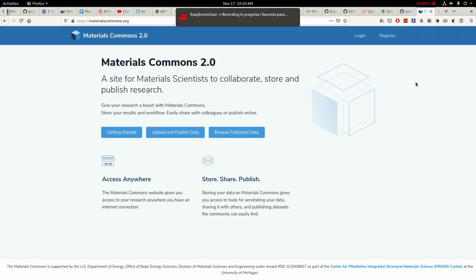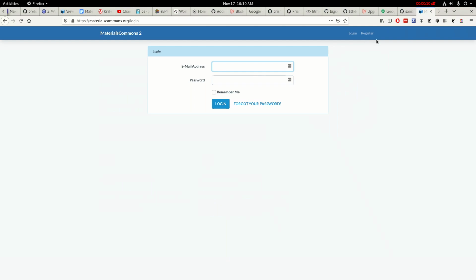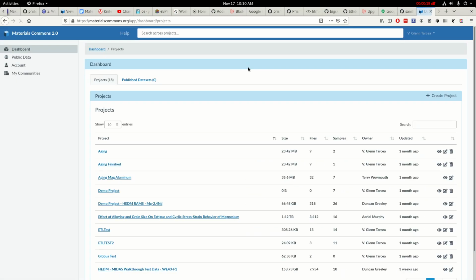This video will give an overview of the Materials Commons project site. To log into the project site, you just click the login button, and if you need to register, you can register for an account. So we'll log in. And once you've logged in, you'll be taken to the dashboard.